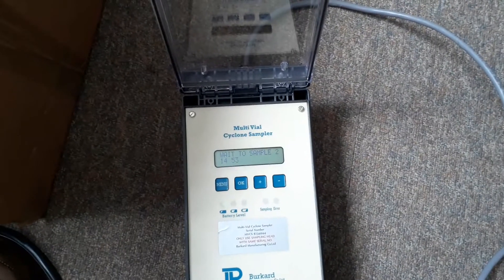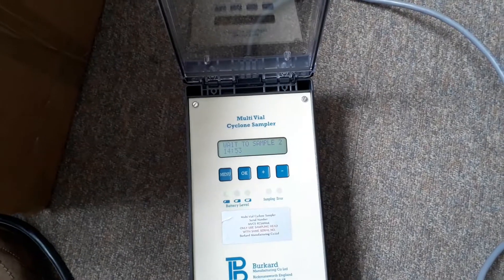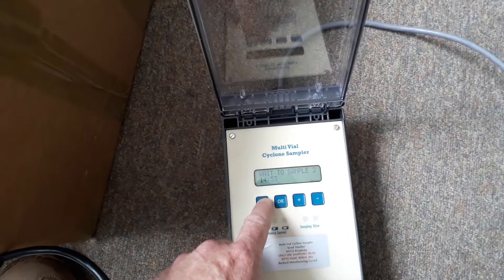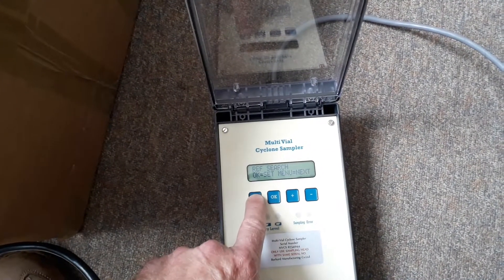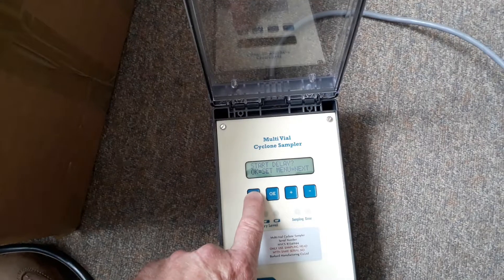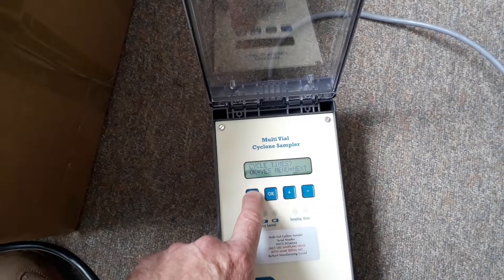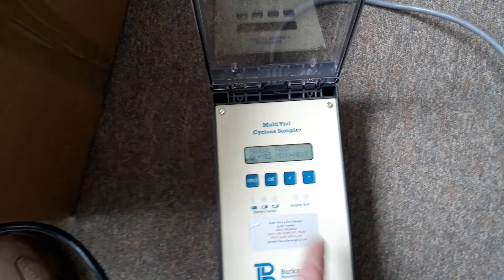It's also possible to manually start the fan any time when it's stopped, as long as the timer is connected to the power supply. We simply advance the menu option past the clock set, start delay, sample start, sample finish, and cycle times to manual fan.